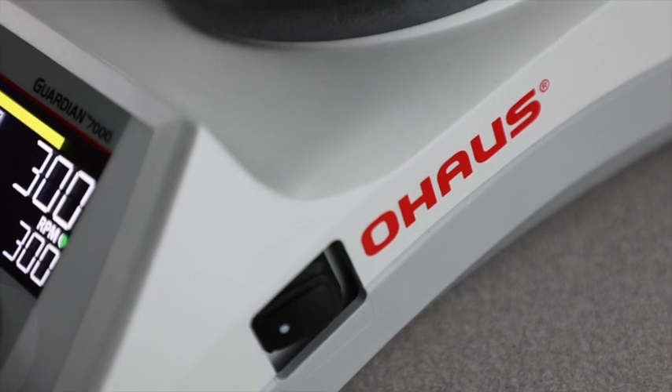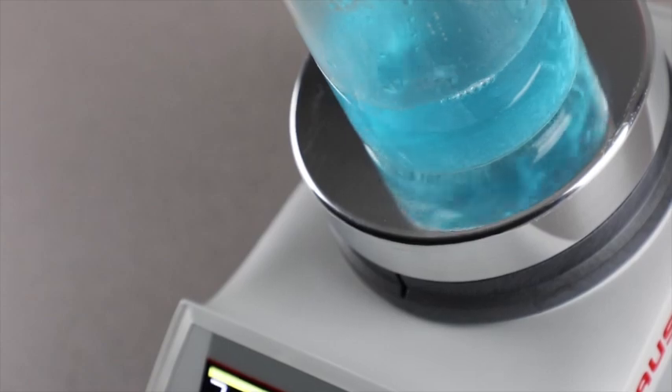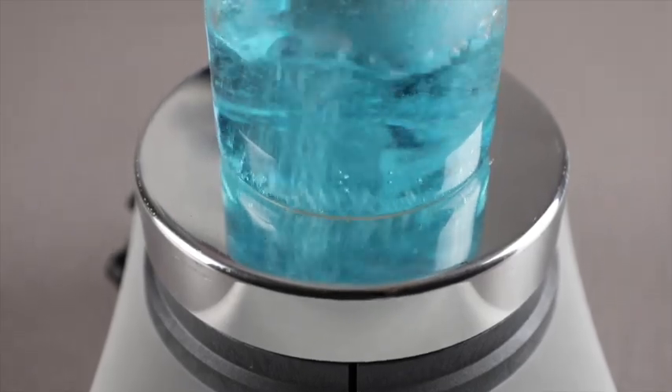Additional cutting-edge features on the Guardian 7000 series include Smart Heat, which protects the lab by controlling the maximum temperature of the Guardian 7000 hot plate stirrer, preventing the overheating of sensitive samples.